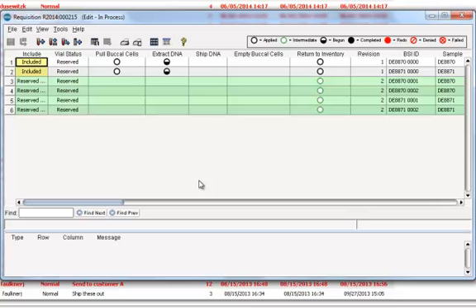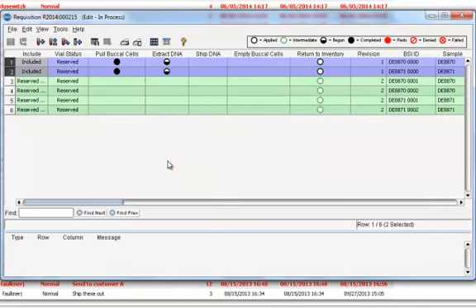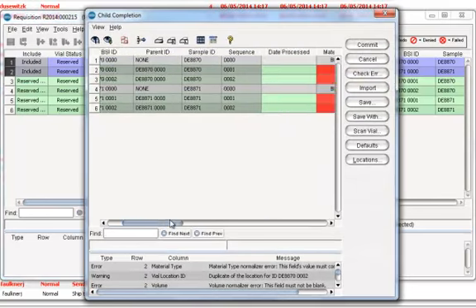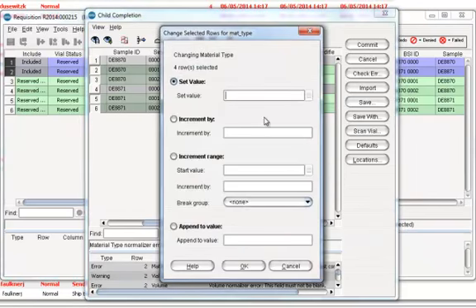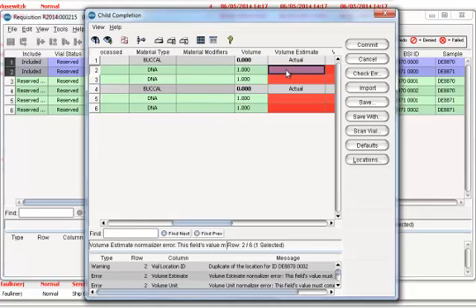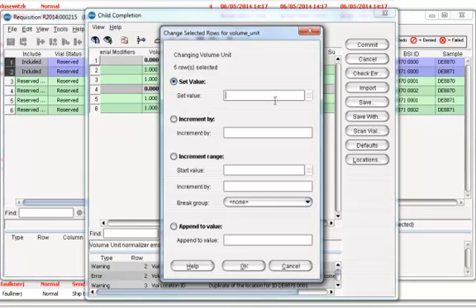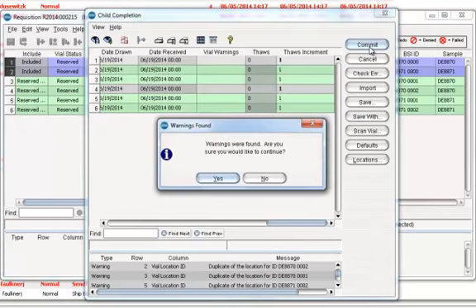For this example, I'm going to quickly complete each task to show the template behavior. I'm going to skip generating reports, adding task data, and scanning to complete tasks. Task statuses will change as the specimen data changes.